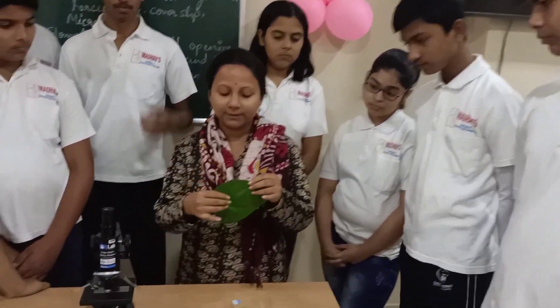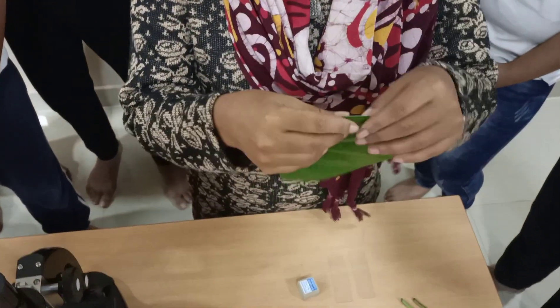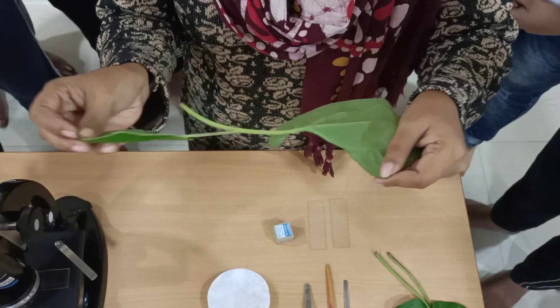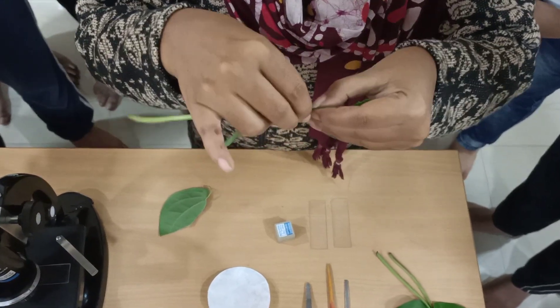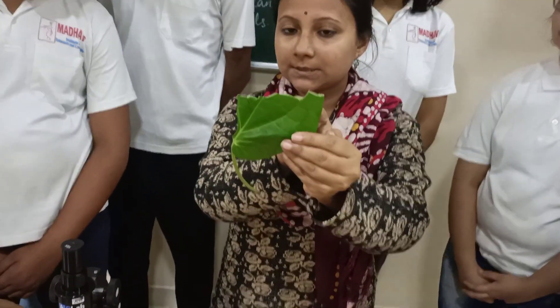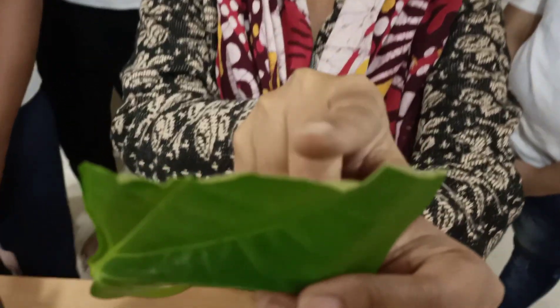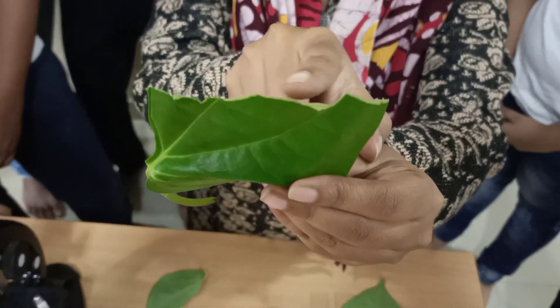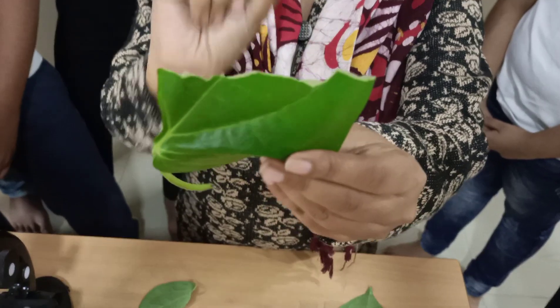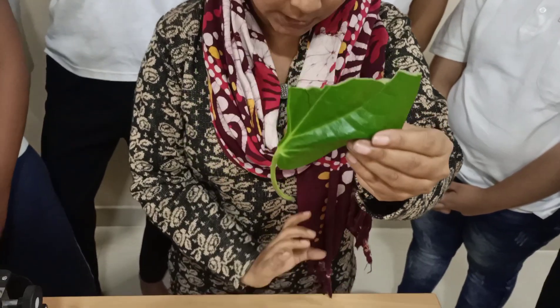You will hold the leaf with the back side towards your face and tear it in this way. Have you seen the process? Again I am showing — you will tear it in this way. Now you can see this white layer — this is the epidermal layer of the leaf. We have to separate it with the help of forceps and keep it on the slide carefully.